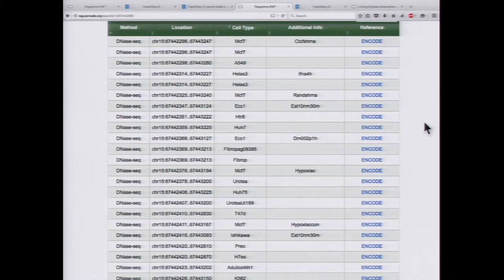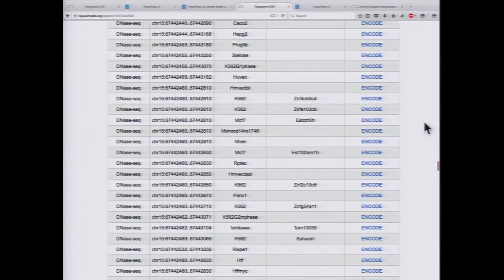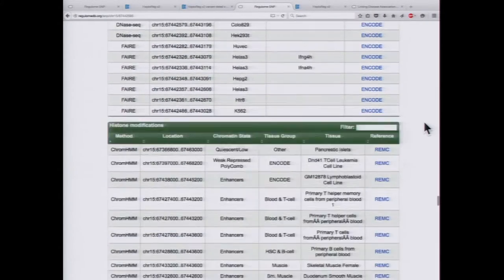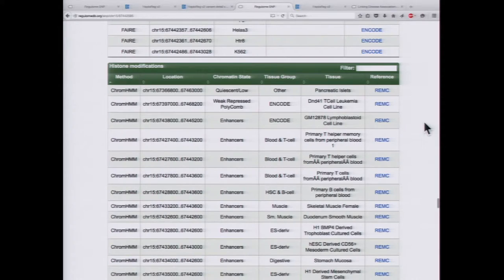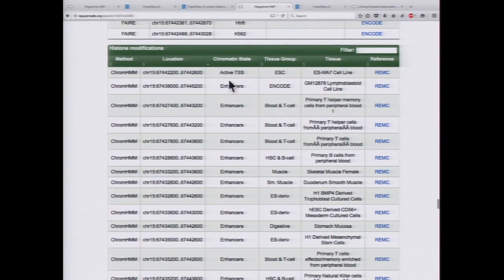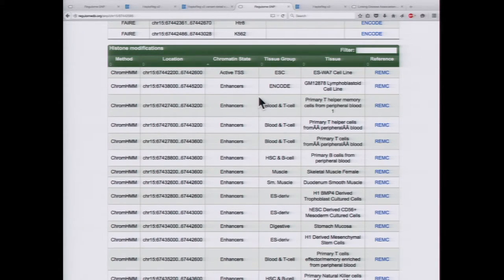There's a lot of activity going on — a lot of DNase hypersensitivity regions in many different cell types. There's also a predicted active TSS site as well as enhancer regions in this region.